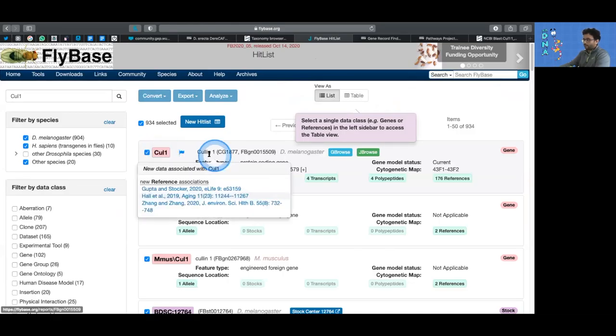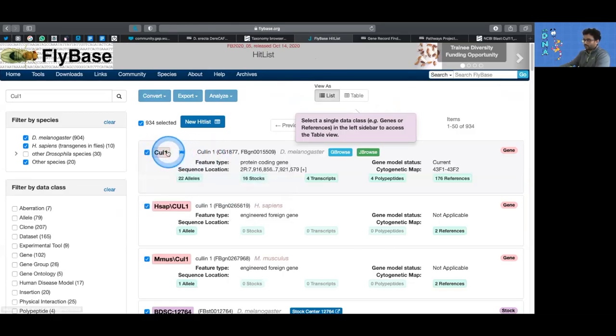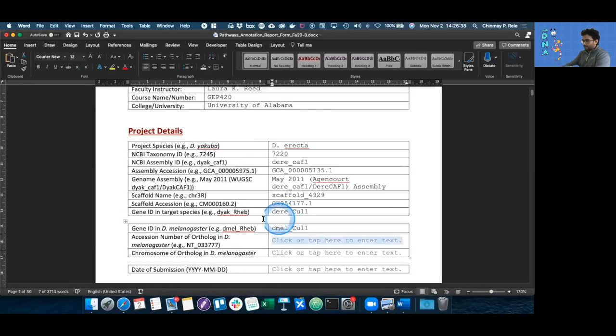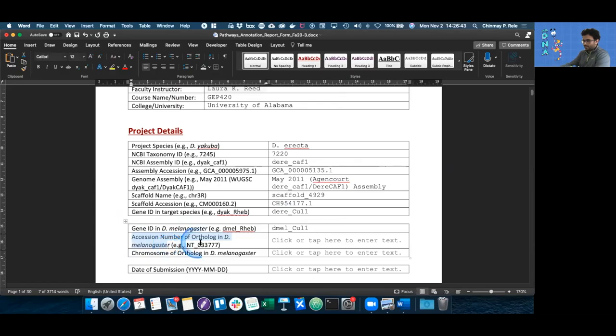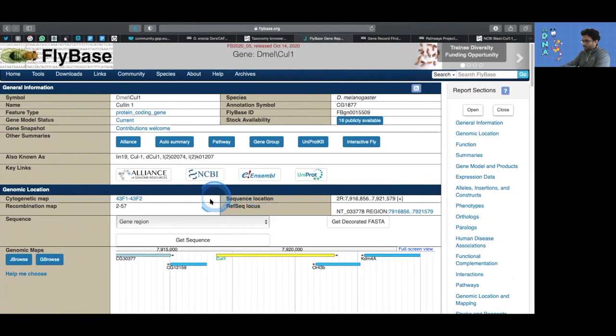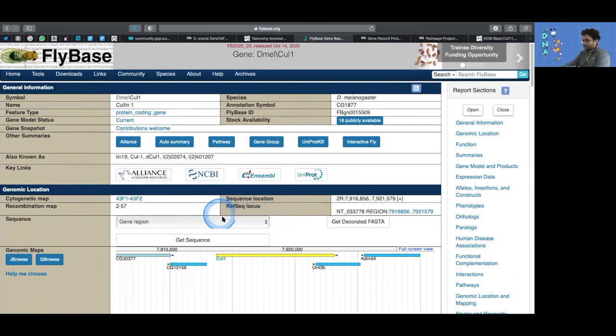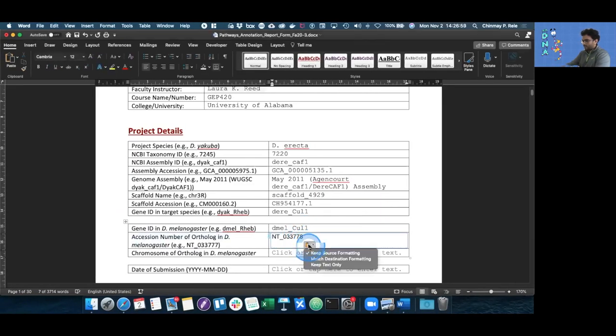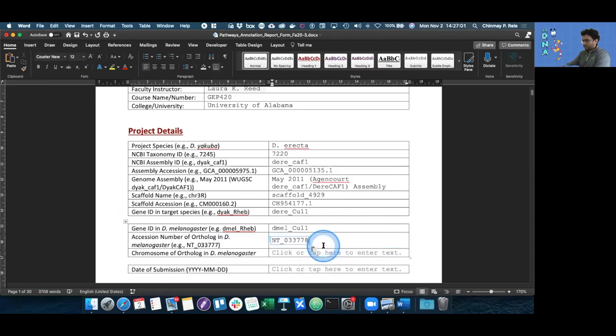Now that we have found our gene, we need the accession number of the gene in melanogaster. To get that, we need to go to the RefSeq locus region within FlyBase. The accession is the NT ID, which we then can copy and paste in the document. And as always, keep text only.